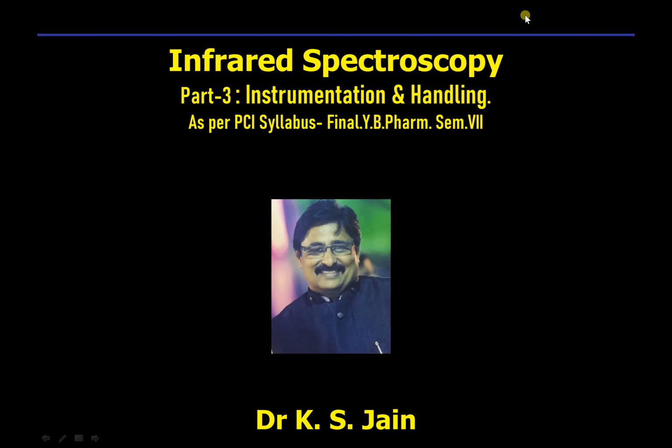Part of infrared spectroscopy videos of this series. We're basically going to discuss the instrumentation and handling after seeing all the theoretical aspects in the earlier two videos. In this particular video, we are going to cover the basic aspects of the instrumentation, and we are going to have one more video where we will touch the more complicated and advanced aspects.